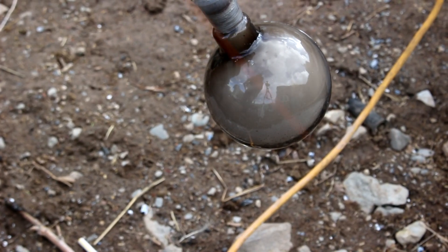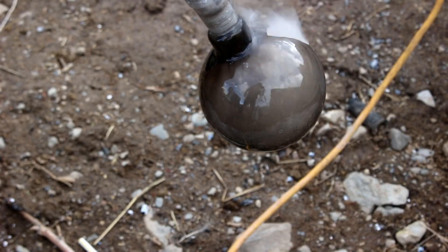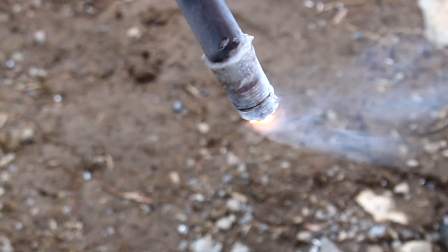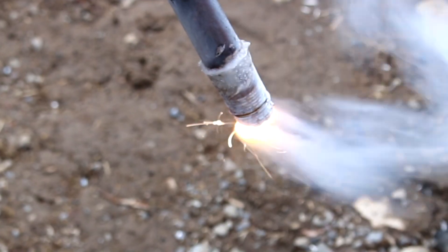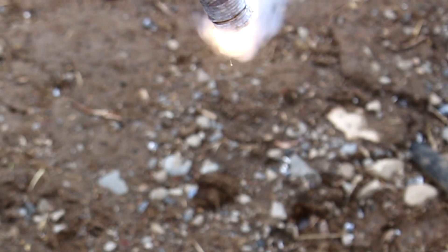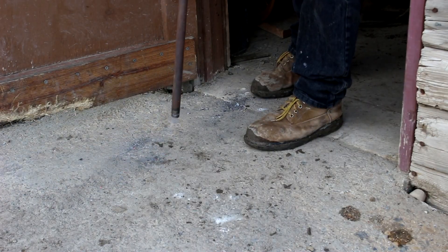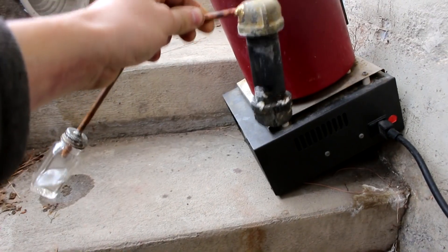Some cesium vapor is getting down in there — and it just blew something up. It appears that we had a boilover. That's actually not cesium burning there, that's lithium. Some lithium came over into the flask. Not sure what to do about this. Put out the fire for one. So I think the problem was that I tried to do too much too quickly.